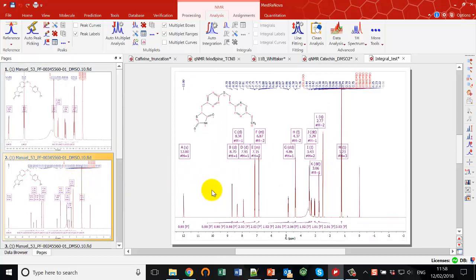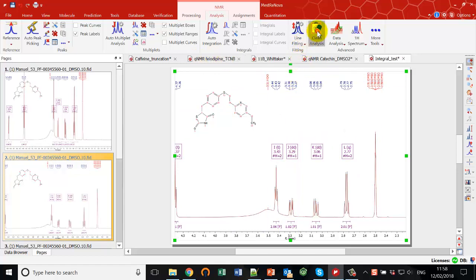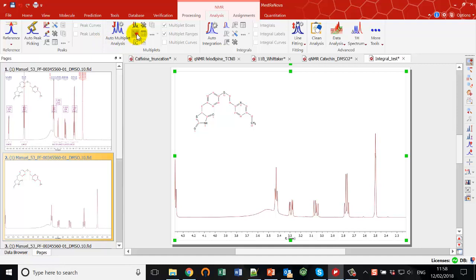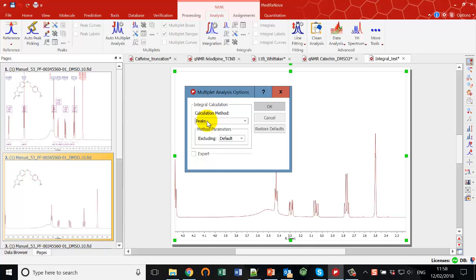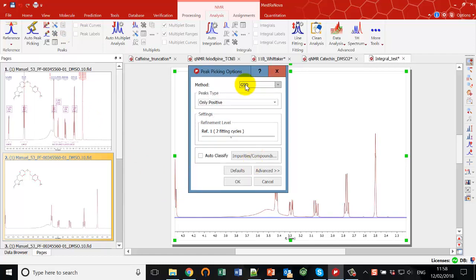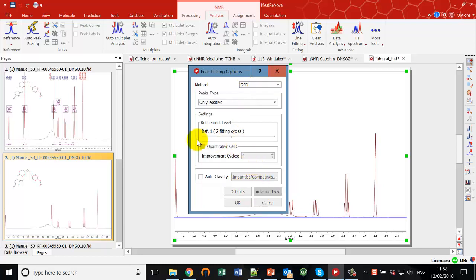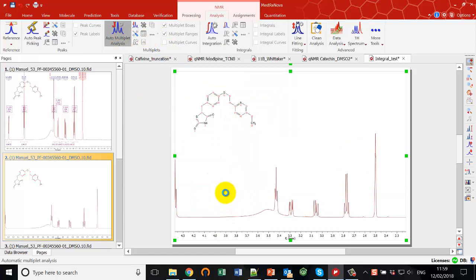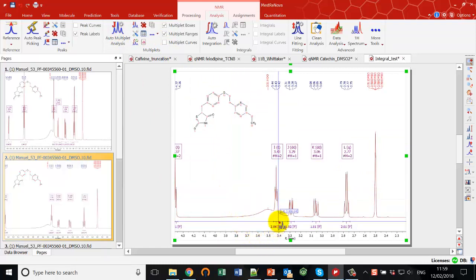Focusing on the overlapping region, the second method is GSD integration. I'll remove the analysis, go to auto multiplet analysis options, and select 'Peaks' as the method. I also need to go to the peaks options and choose GSD as the method. Under advanced, I need to make sure QGSD is not selected for this — that's where I would choose it when I do want it. So with GSD selected and clicking OK to run multiplet analysis, you'll see the integration of this multiplet has changed quite considerably and is now in line with the methine signal here, which is reasonable.